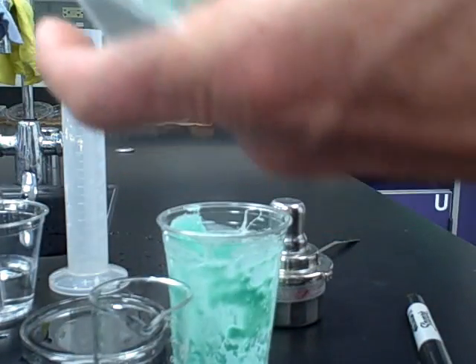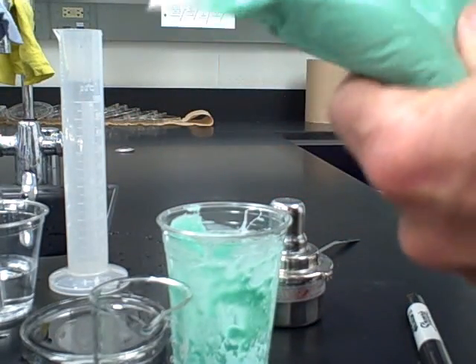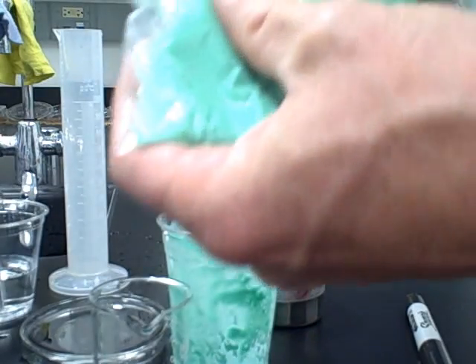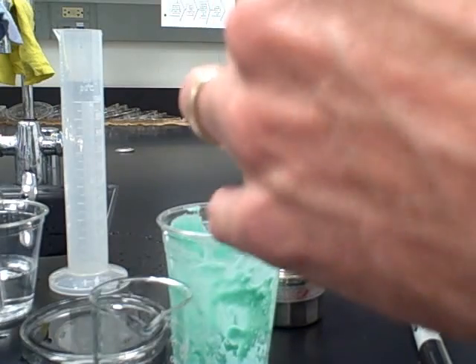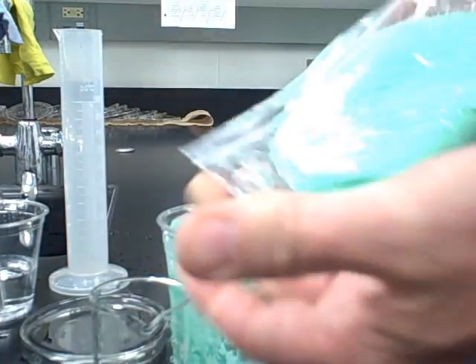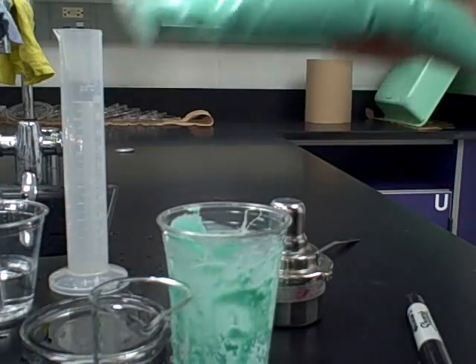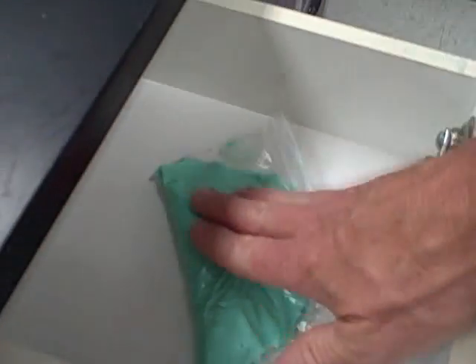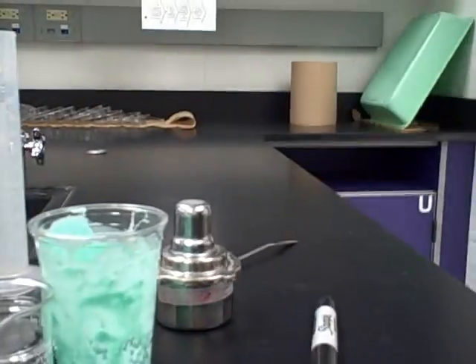Put it in the zip lock bag, try to flatten it out, get most of the air out of it, and then zip the bag so the amorphous solid is sealed off from the outside air. Then take this and put it in your drawer — lab group, period three, put it in drawer three. Tell it to rest nicely and hopefully it will be very nice when you come back tomorrow.